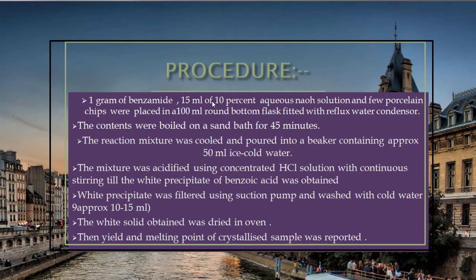Now we will see the procedure in the lab. 1 gram of benzamide, 15 milliliter of 10% aqueous NaOH solution, and a few porcelain chips were placed in a 100 milliliter round bottom flask fitted with a reflux condenser. Porcelain chips were taken to avoid bumping of the solution when heated.